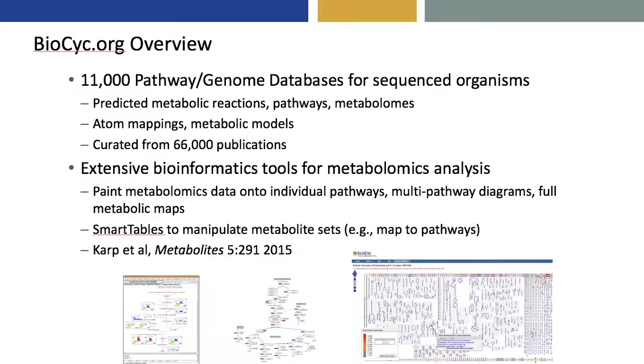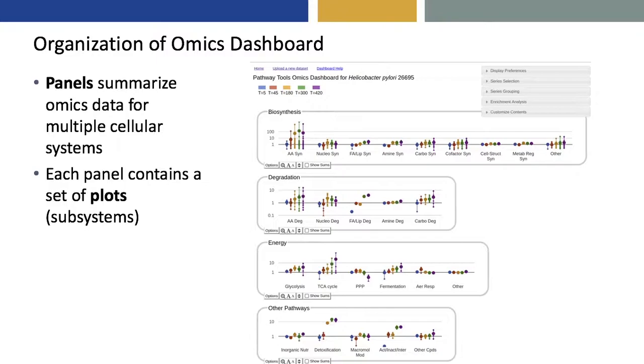And these tools are all described in this publication in the Metabolites Journal from 2015. But let's now proceed to talk about the Omics dashboard. Let me start out by talking about the organization of this tool.